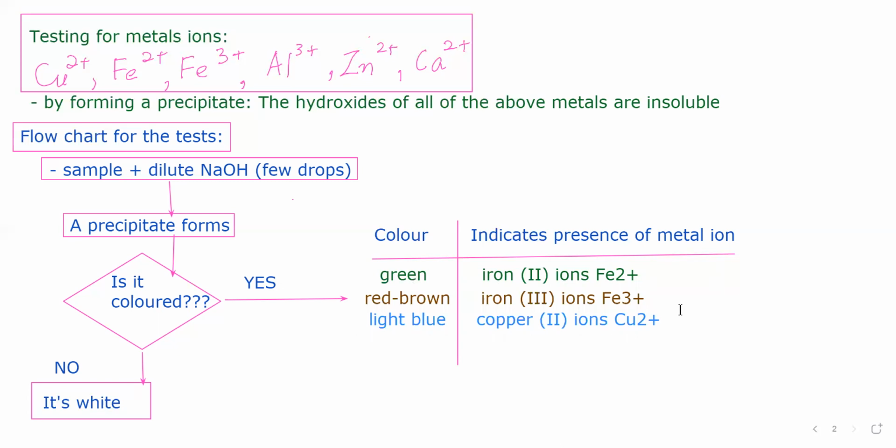I might have gray green as well. When I'm talking about gray green color, one more. Oh, I missed out chromium in the list, right? Gray green can also be added, and gray green is going to indicate the presence of chromium ions. Chromium 3 basically.